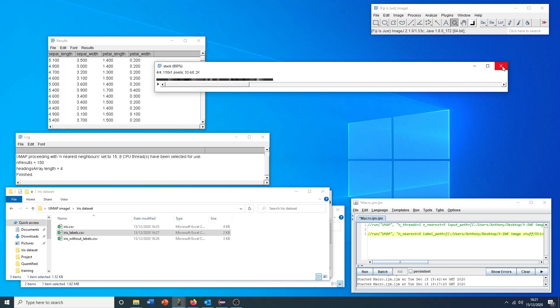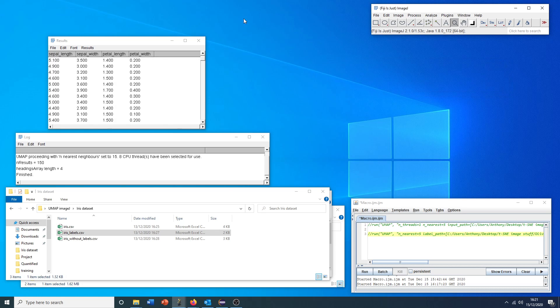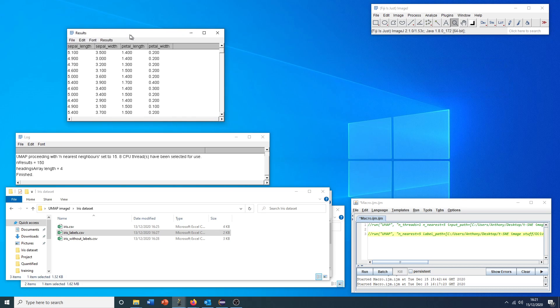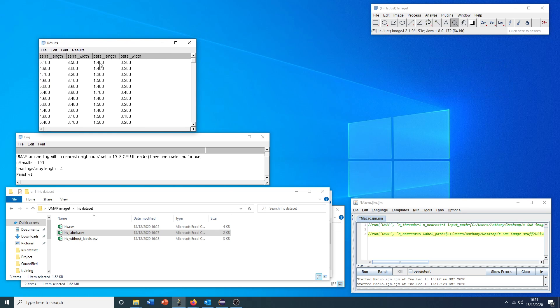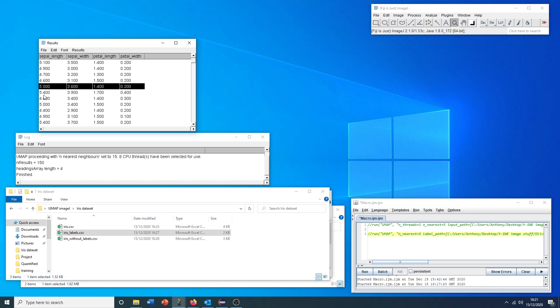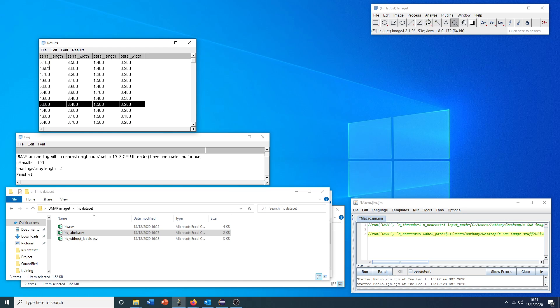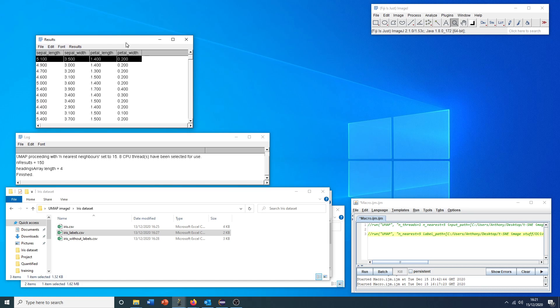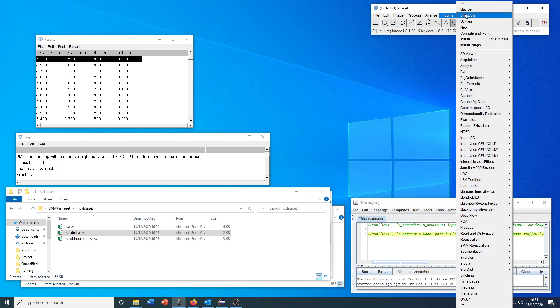However, what we need to do before we do this is actually transpose this data. Maybe counterintuitively, this plugin wants to see each individual instance of an object, of a flower or whatever, as separate columns. At the moment, they're represented as separate rows, which is probably the more conventional organization. But what I've added is a nice convenience feature to allow us to transpose this quickly.